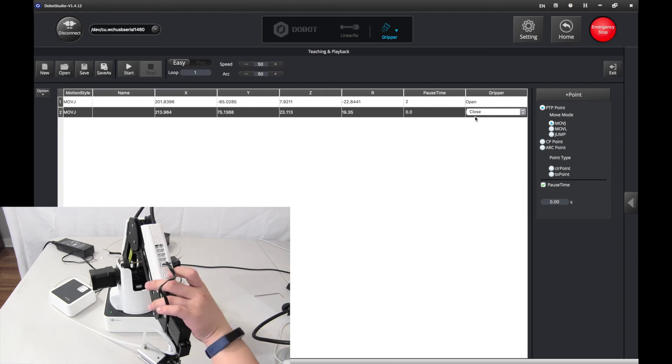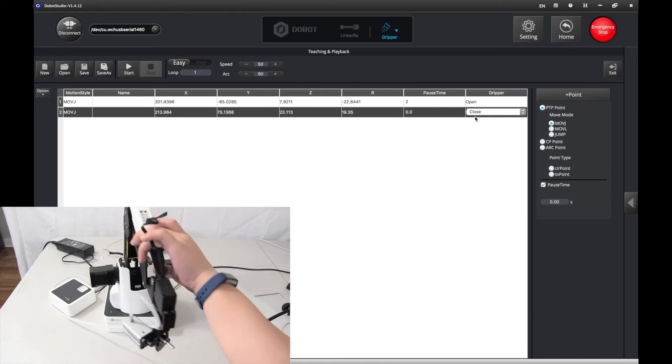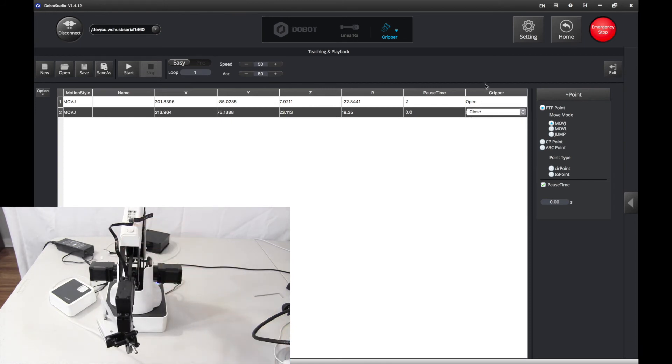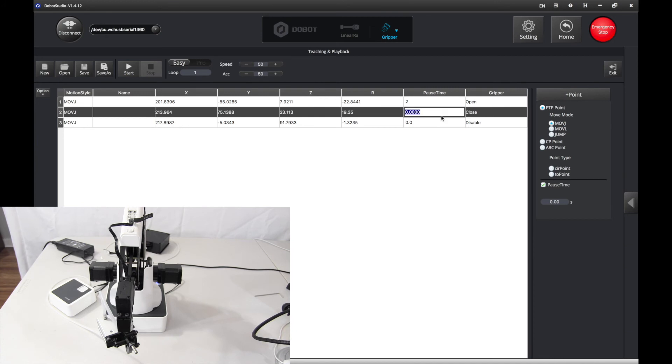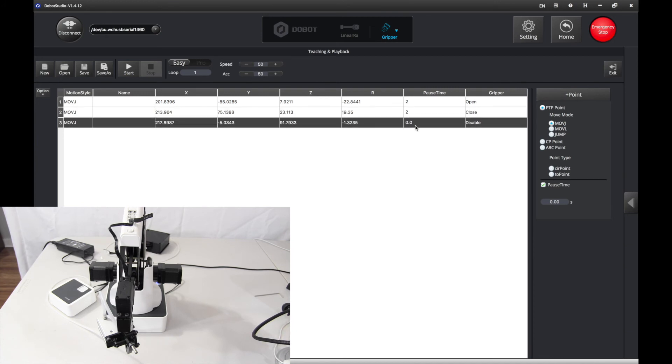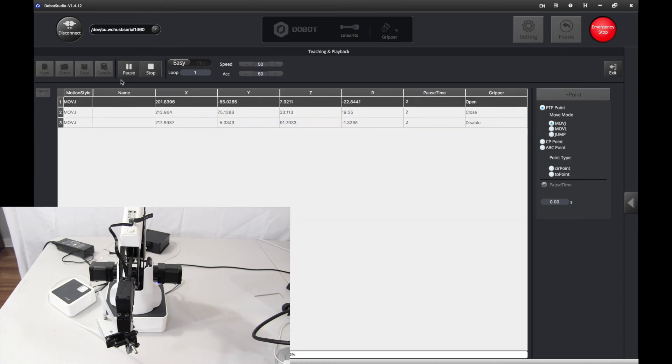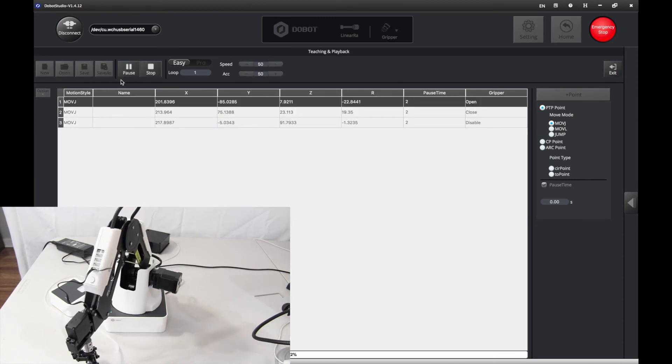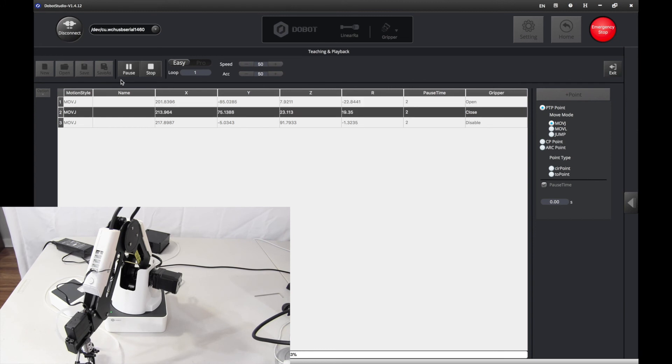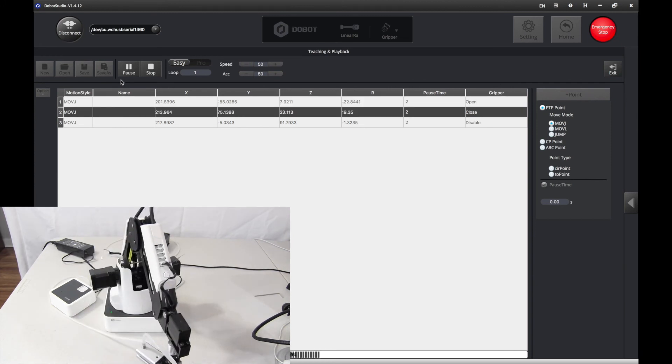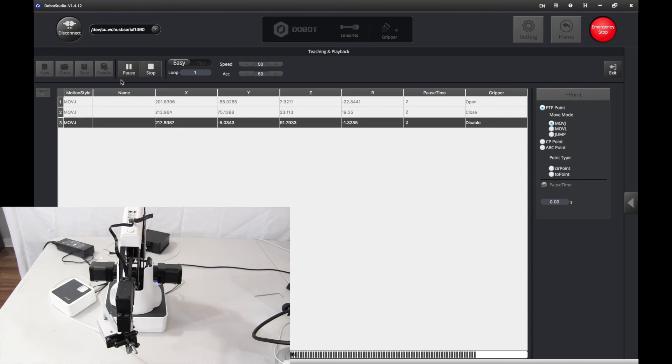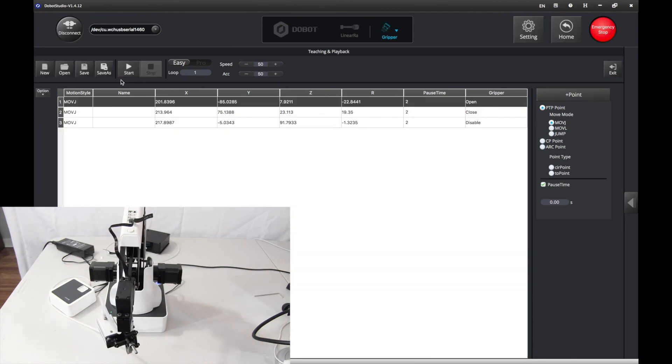Then you want to move it up. And you want to disable it. Now, let's press Start, except we have to have a little bit of pause time for each of these. That way. And let's press Start.